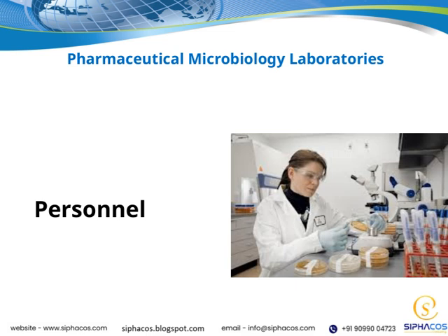Microbiologists are the experts who design and oversee testing procedures, interpret results, and troubleshoot any issues that arise. Laboratory technicians support these efforts by performing routine testing and maintaining the lab environment. Quality assurance personnel ensure that all procedures adhere to regulatory standards and good manufacturing practices.